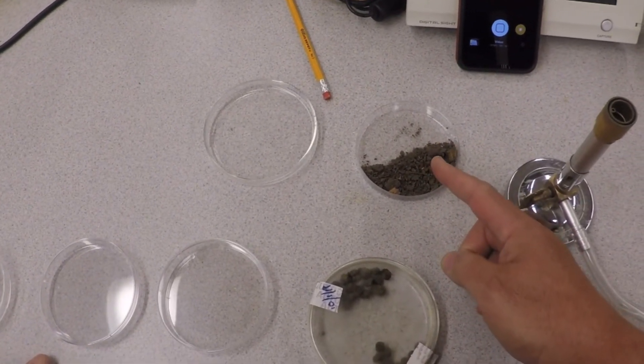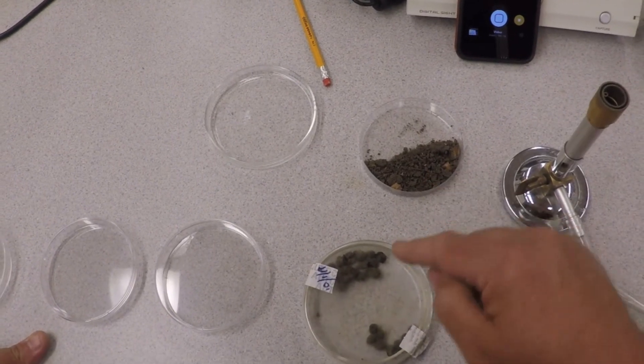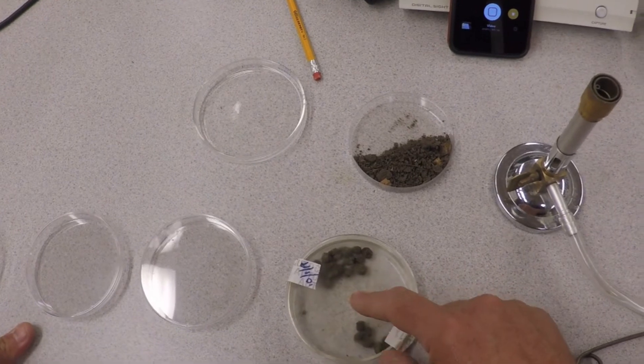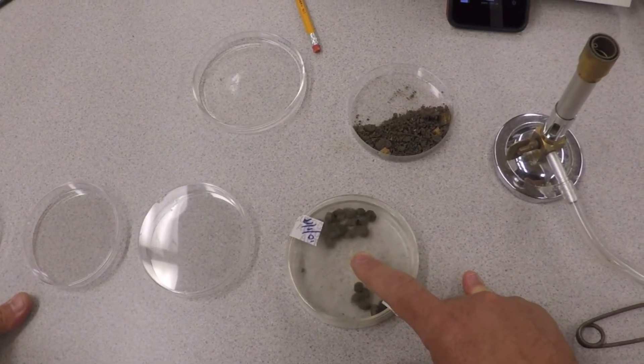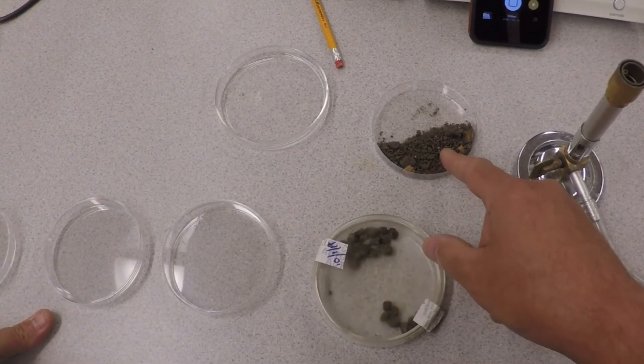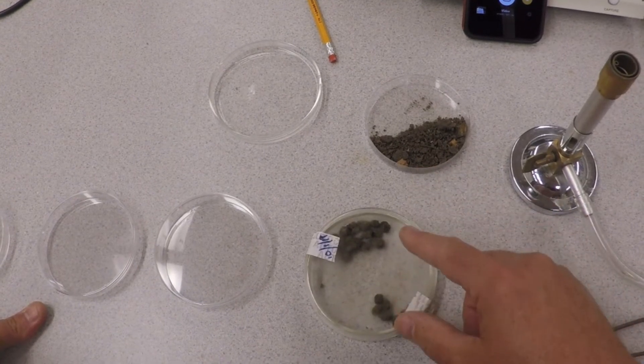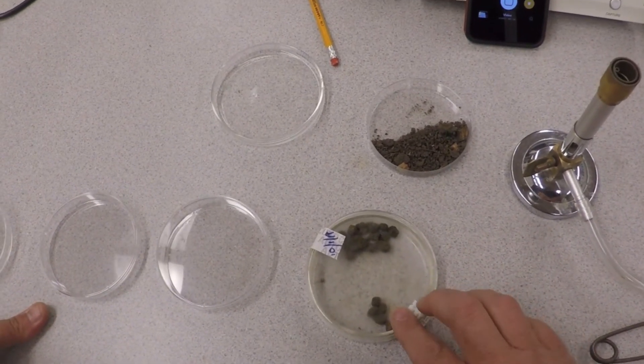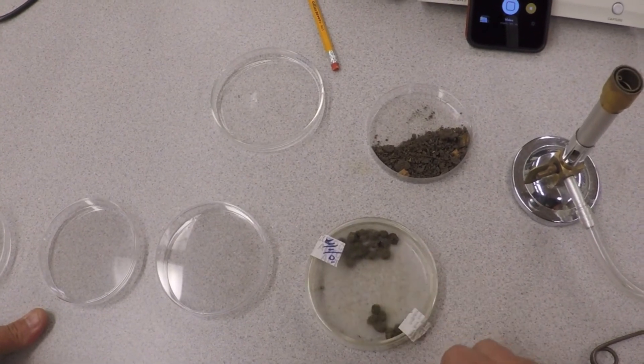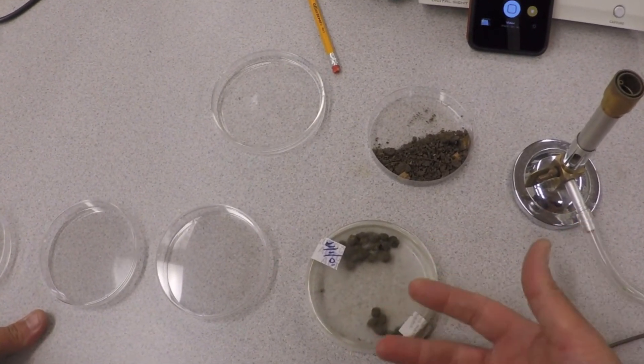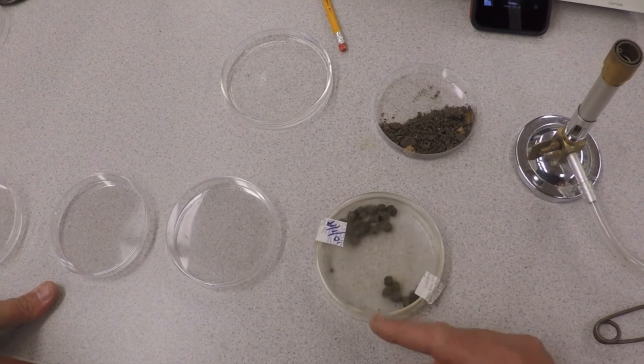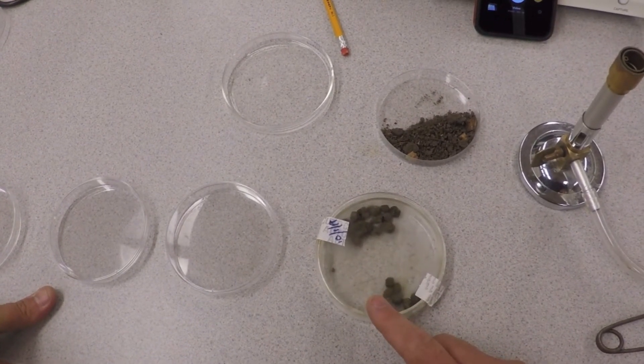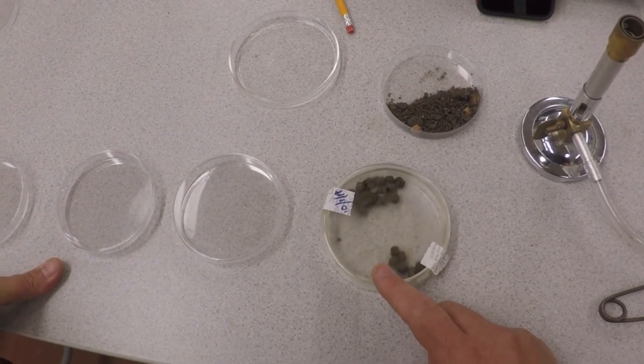But the myxos will be attracted by what's in these dung pellets, the bacteria that are in these dung. Because remember, dung is essentially wall-to-wall bacteria. And so they will come out of the soil. We hope they will go to the little dung pellets and literally crawl on top of them. They will eat the nutrients, the bacteria that are in there. And over time, probably about two weeks, they will run out of nutrients and they will go into a developmental life cycle.